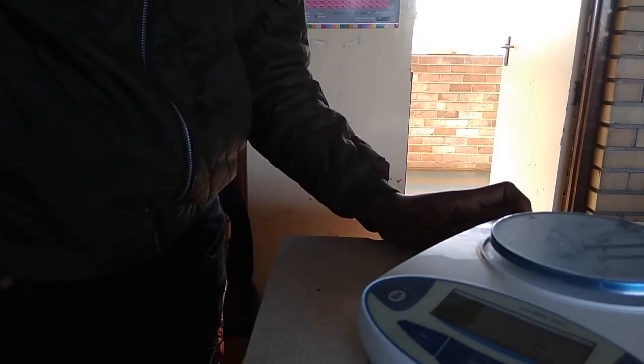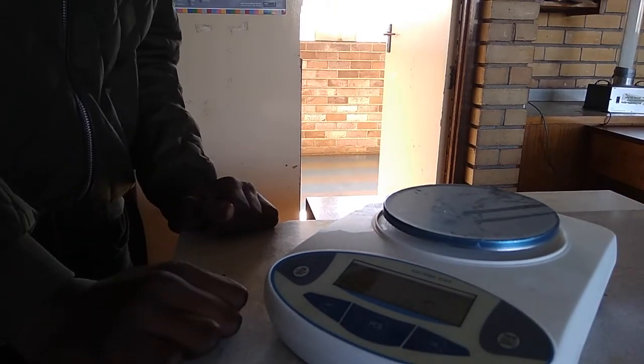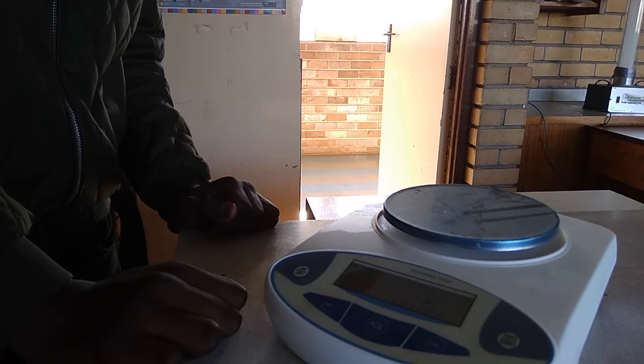Okay, so Matsubiso, you're going to see now how Pascal operates that. Can I see the scale? I think maybe. Okay, there. Now, Pascal, what does it read?